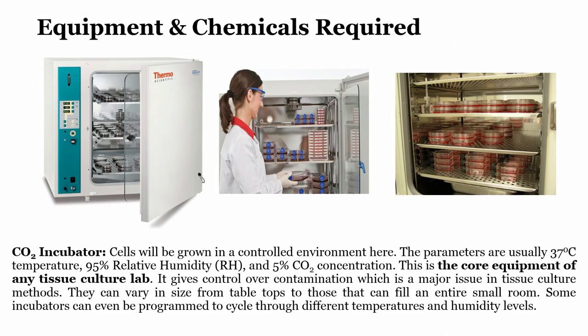Now, like I said, the focus of today's lecture is to understand cell and tissue culture. However, it is also to understand what equipment and chemicals are required, and one such equipment, like we discussed in the previous example, is a CO2 incubator.